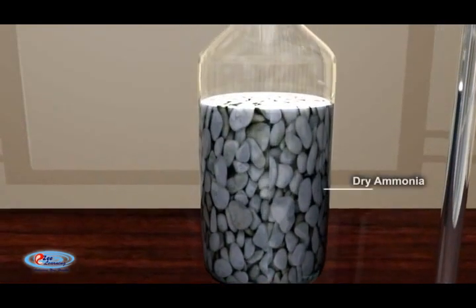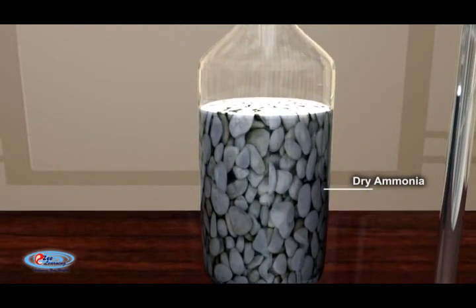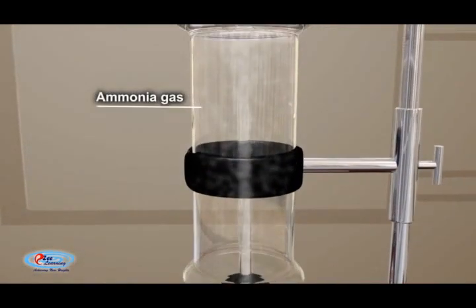Notice that the ammonia is collected with the gas jar upside down. This is because ammonia is less dense than air.